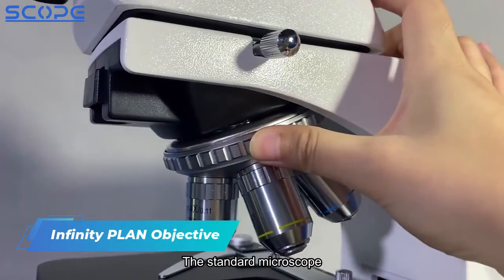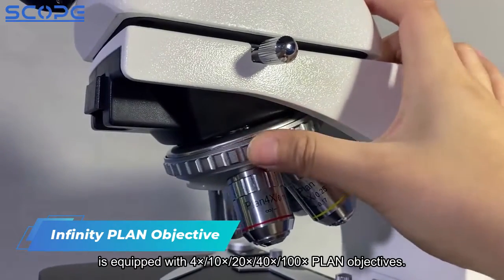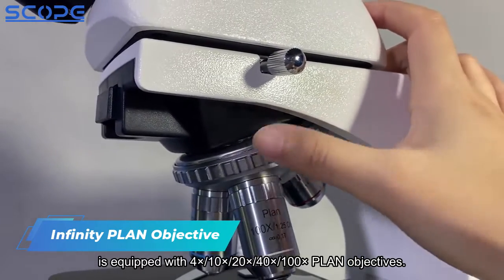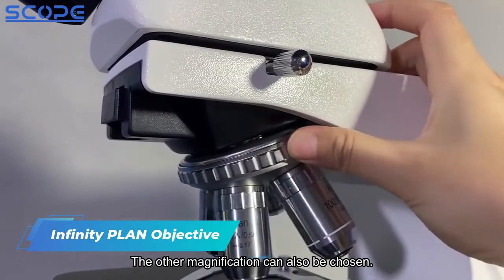The standard microscope is equipped with 4x, 10x, 20x, 40x, and 100x plan objectives. Other magnifications can also be chosen.